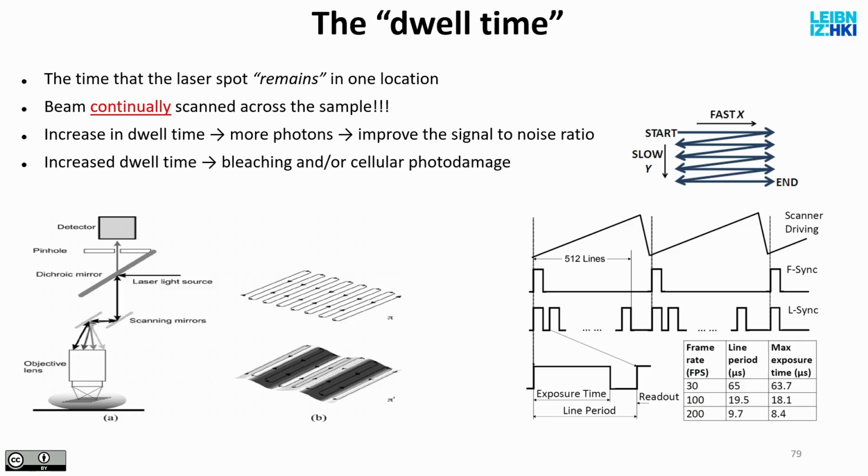I increased the resolution of the image. So what I can do with a point scanning confocal microscope is set the absolute optimal imaging conditions. No other microscope can do that, because here I have full freedom to set anything up.